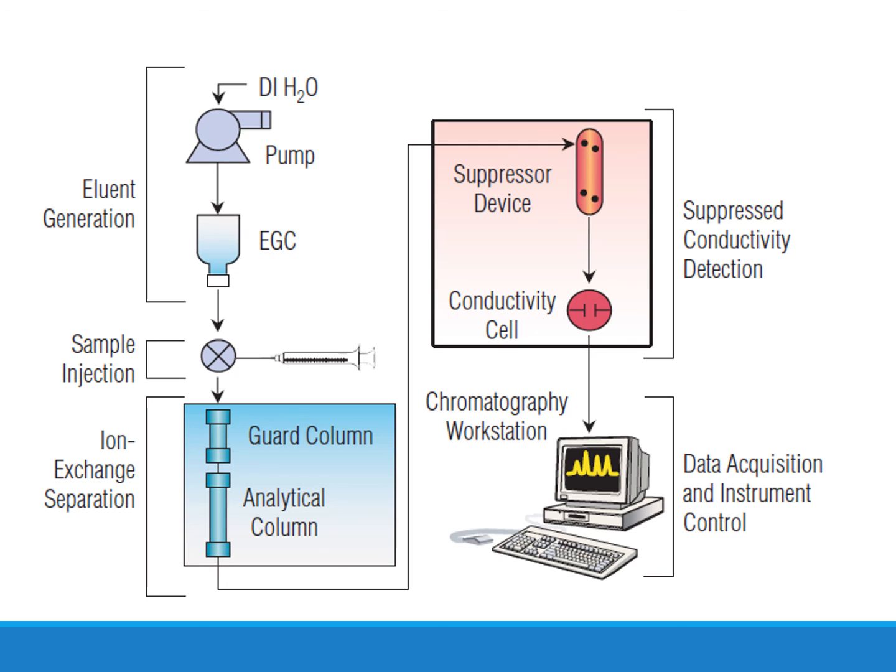Finally, how does the overall ion chromatographic system work? We start with the mobile phase. In this case, you can actually use eluent generators. So instead of making the mobile phase by dissolving potassium hydroxide or sulfuric or methane sulfonic acid, you can actually use pure water and a solid reagent, and we can generate it electrolytically.